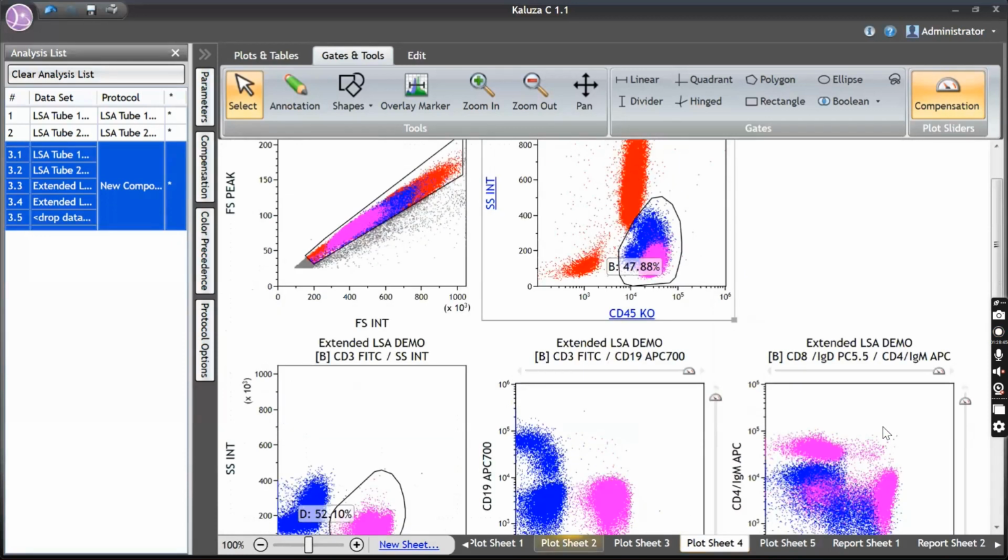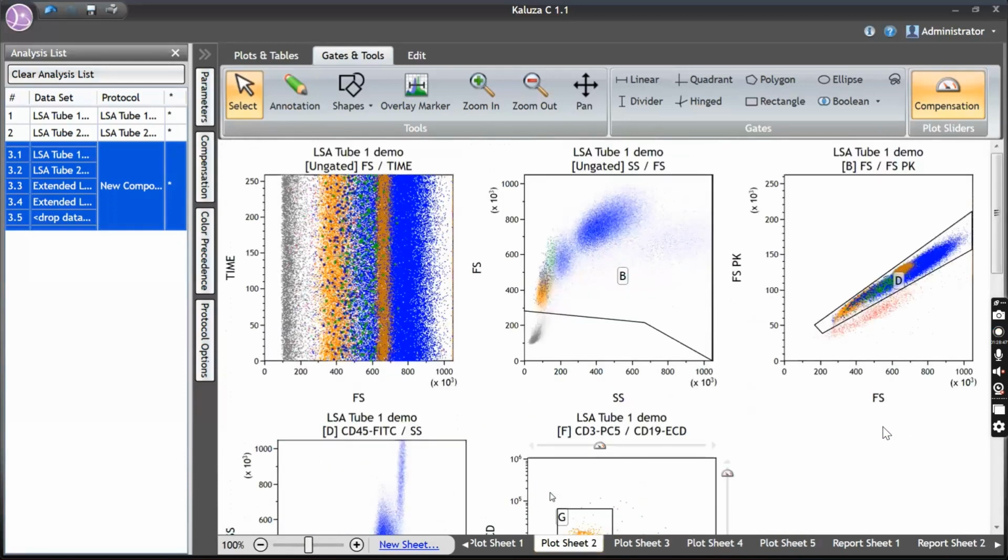Any doubts? I could have easily completed the basic lymphocyte subset analysis and finished the class, but I want to show you that an extended lymphocyte subset analysis is always better to do than a basic lymphocyte subset analysis. I just want to show you a glimpse of it. So in your future, if you're doing this, definitely try that. Any doubts?